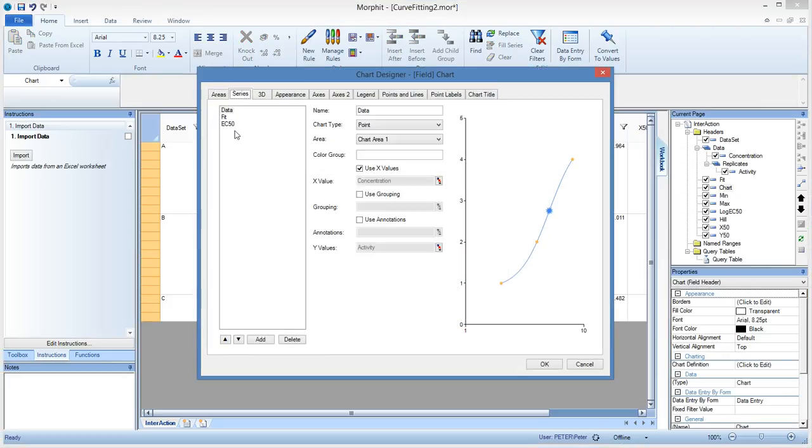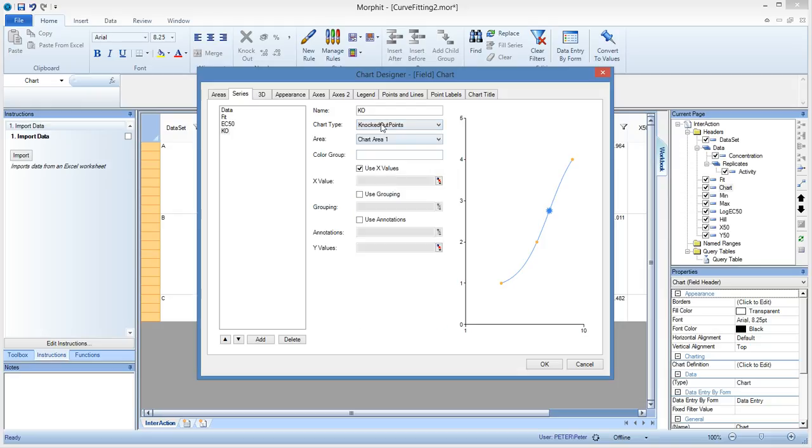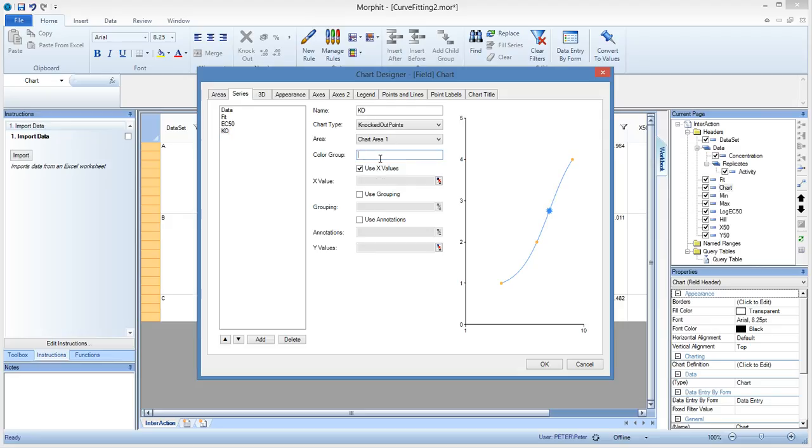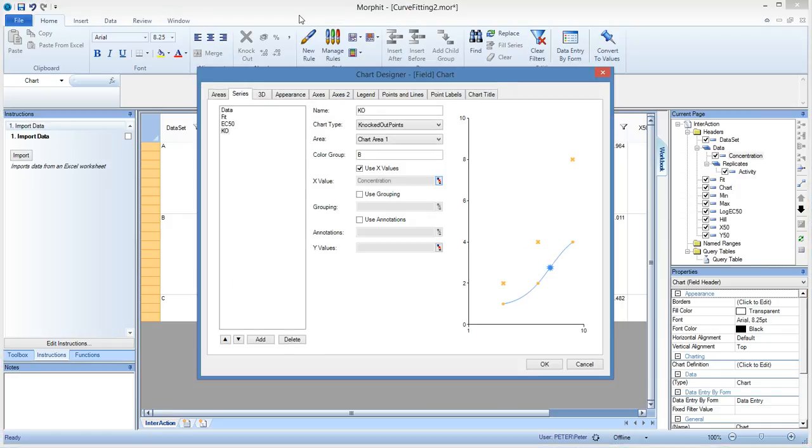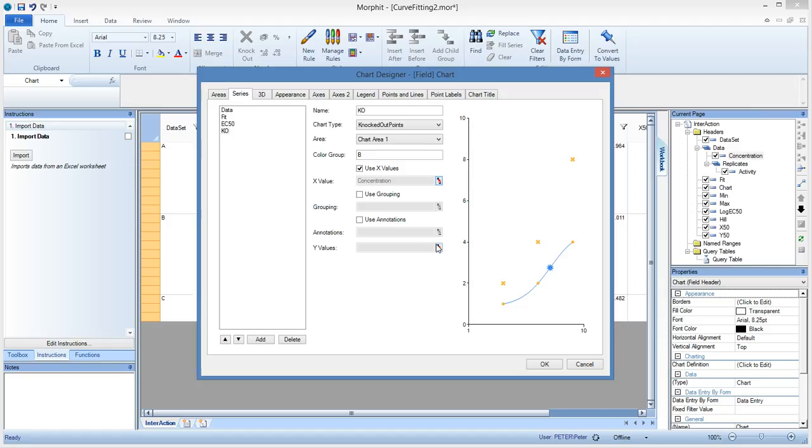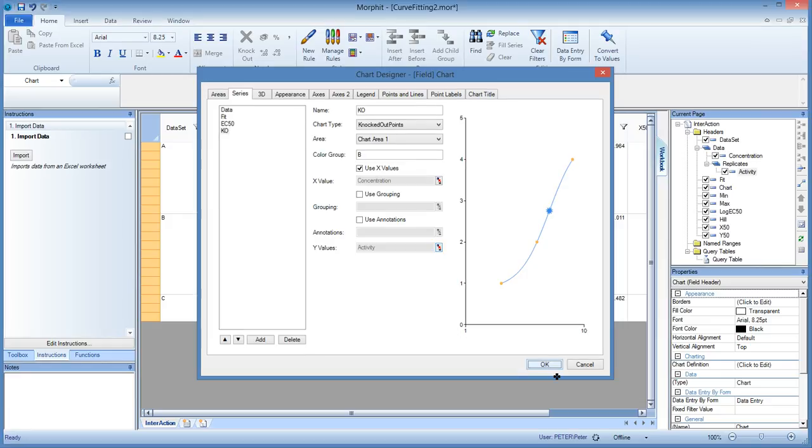So what we want instead is that you get visual feedback again in your chart about which data points have been knocked out. So the solution is, again, go to the series, add a new data series, and then we call this knockout. And that will be a special chart type. And that is called the knocked out points. So this is telling Morfit immediately, the way it needs to handle those knocked out points. So it will use crosses and all that instead. So we give it the same color as your data. So the data, we will give it color b. The knockout will also get color b. And then we use as the x values the same as the data, the concentration here. And for the y values, we use the activity.